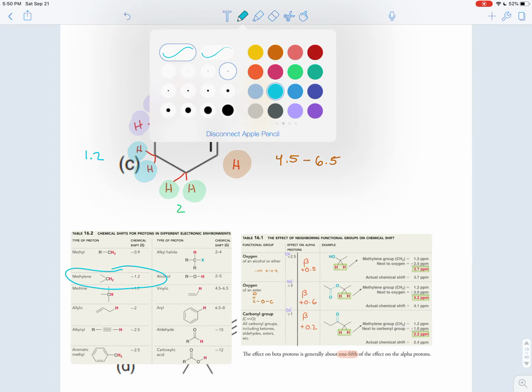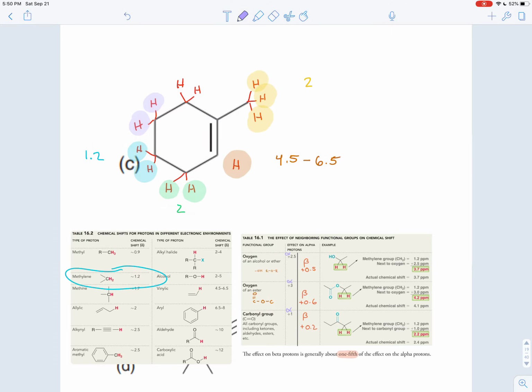These 2 hydrogens share a unique electronic environment. The pieces that are on either side of them is different from the pieces of the molecule that are on either side of any of the other hydrogens. So they'll be represented by a unique peak because they're in a unique electronic environment. And those are also methylene hydrogens. You'd expect them to show up in a peak at around 1.2. Notice they're not allylic because they are 1, 2, 3 atoms away from an atom in a double bond. To be allylic, you have to be 1 atom away from an atom in a double bond.